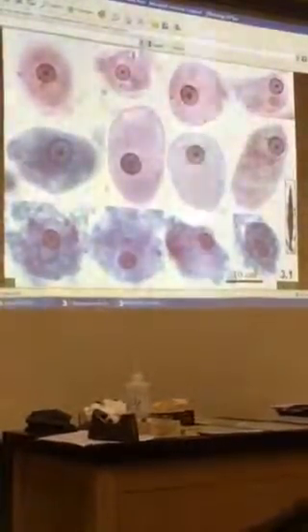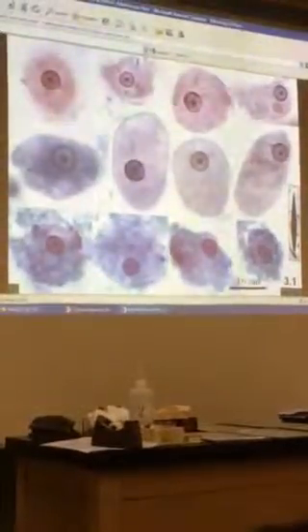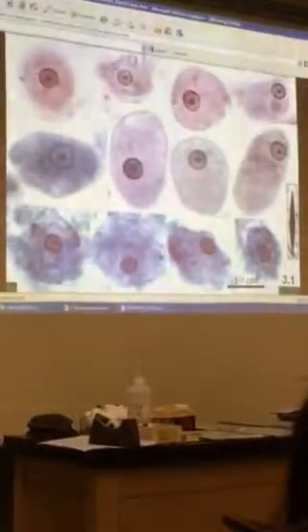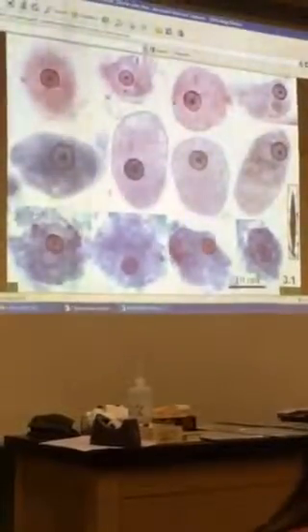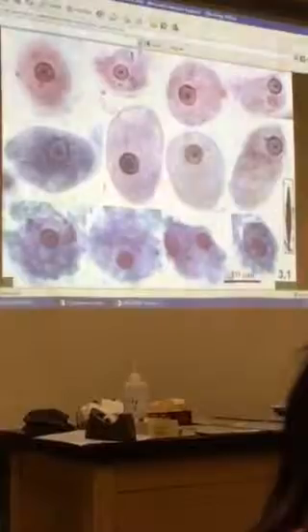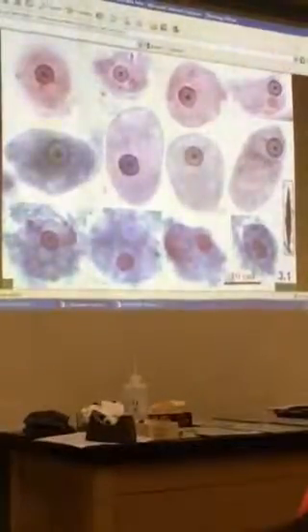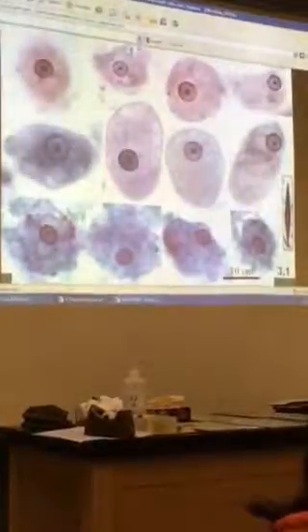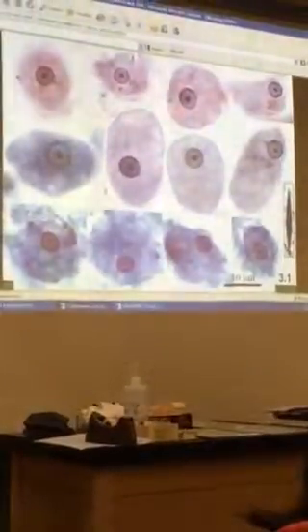And so sometimes it will have food vacuoles. It says non-vacuolate. In other words, it doesn't have a great big old vacuole inside of it like we'll see in some. But it does have food vacuoles. Sometimes the food vacuoles will contain a red blood cell, which is what you see right here. See my pointer? That's an erythrocyte in there that this thing has eaten. The others will not tend to have red blood cells.